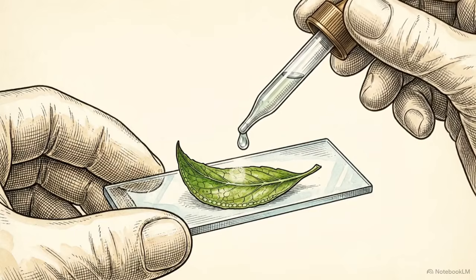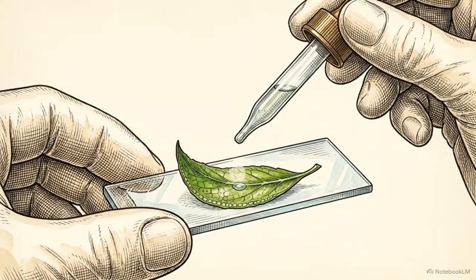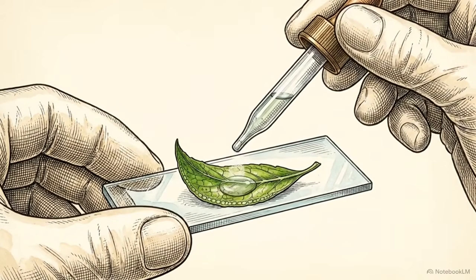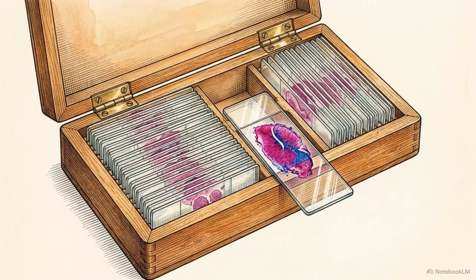For a quick look at a living, moving cell before it dries out, scientists use a temporary mount with a drop of water. To preserve a specimen for decades, they create a permanent mount, meticulously fixing, dehydrating, and staining the tissue to lock its internal structure in place.